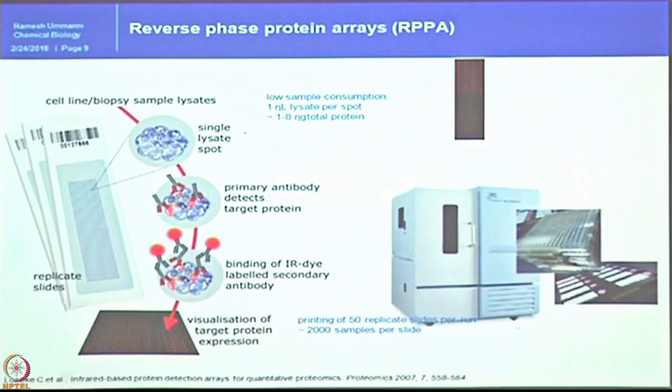In the first slide, if one spot contains 1 nanogram, 8 nanogram, the last slide also should have 8 nanogram protein. So, this machine has been designed in such a way that it will give a uniform printing of the slides, and also from one corner to the other corner it should spot precisely the same amount of protein by maintaining the humidity and XYZ parameters inside the machine.